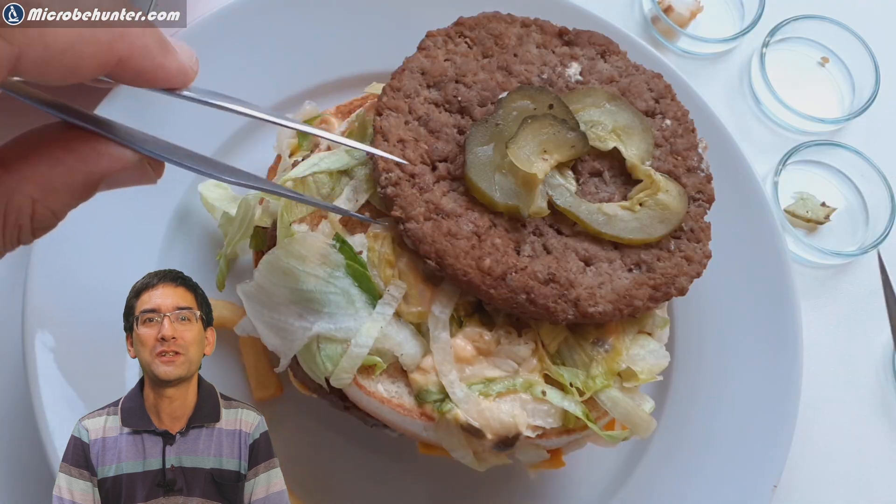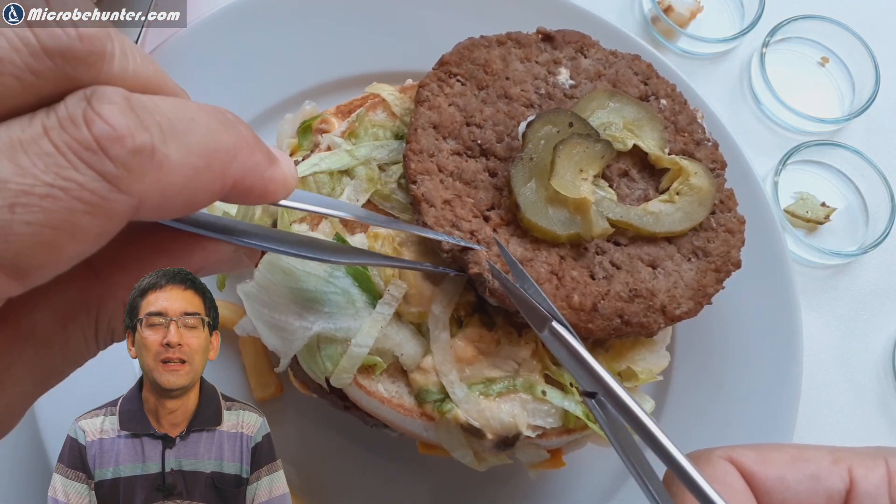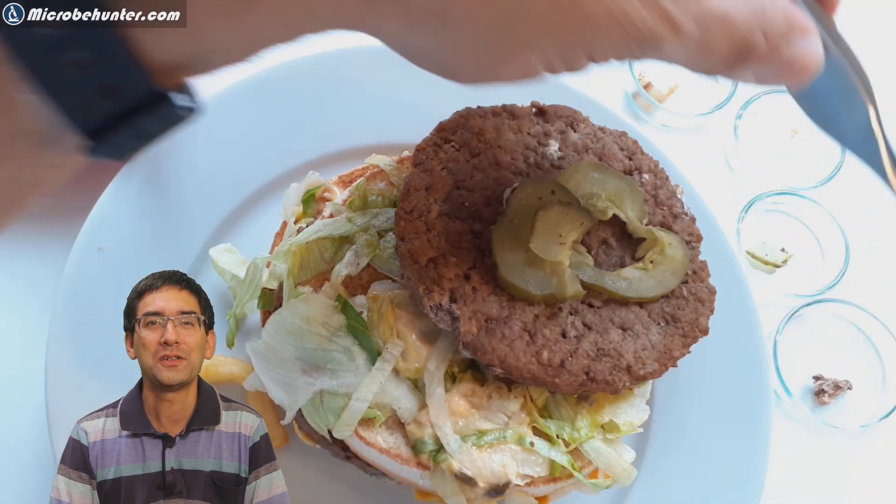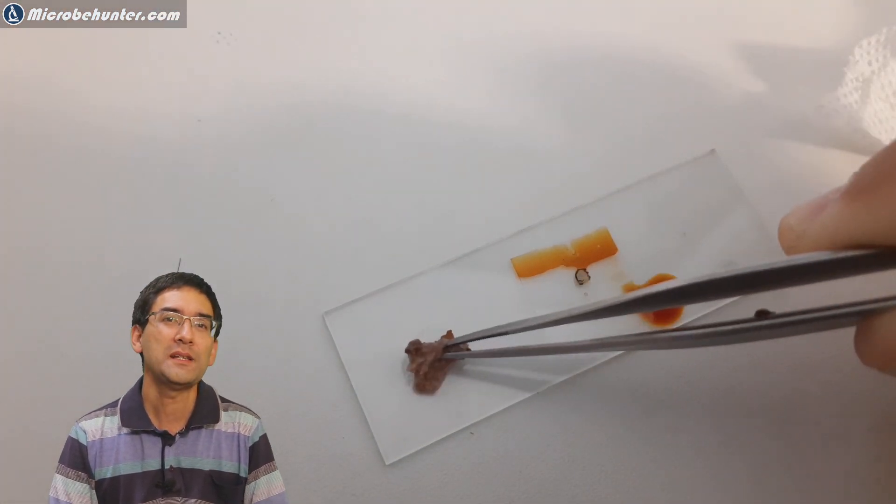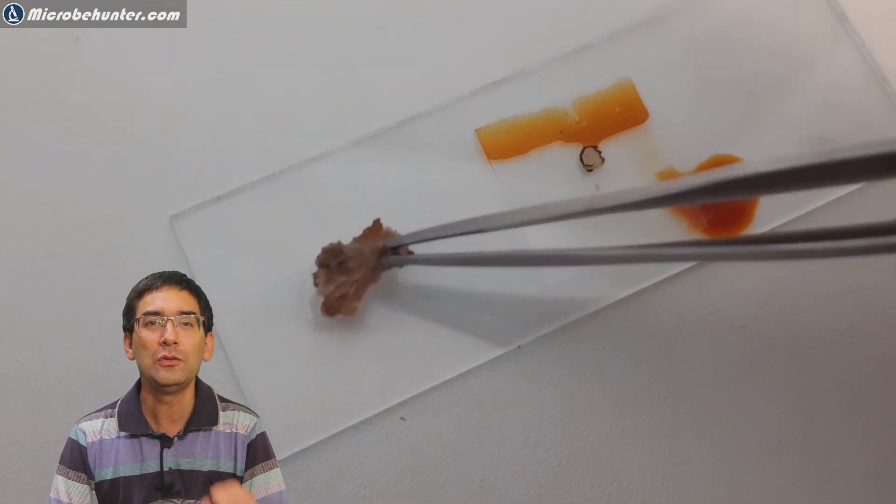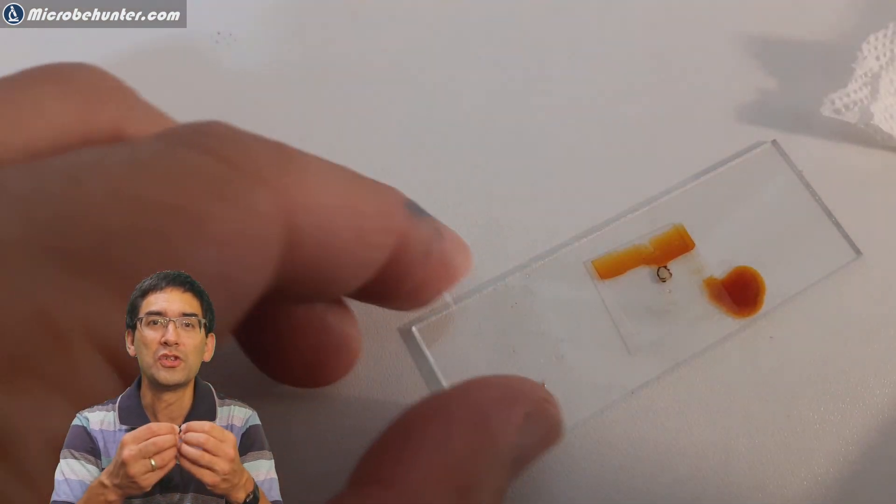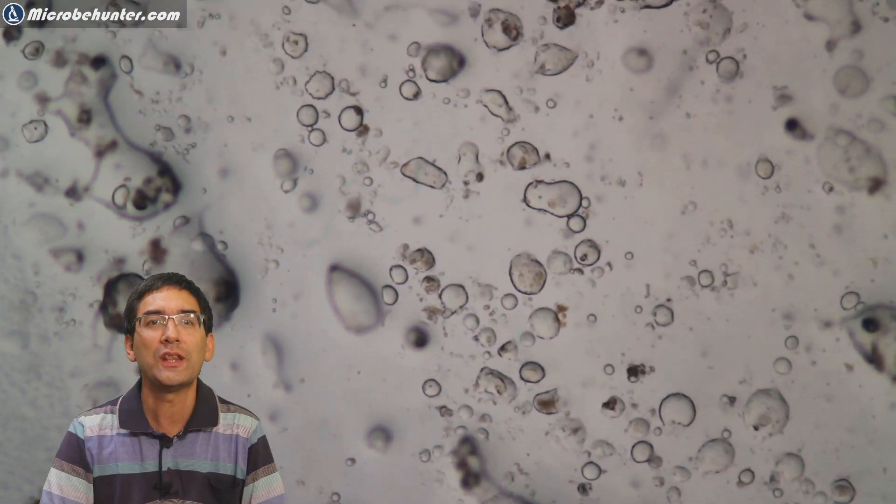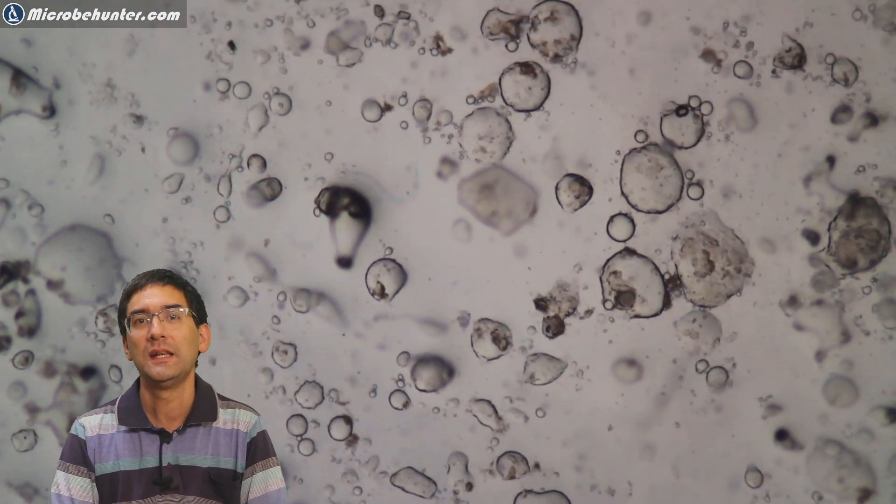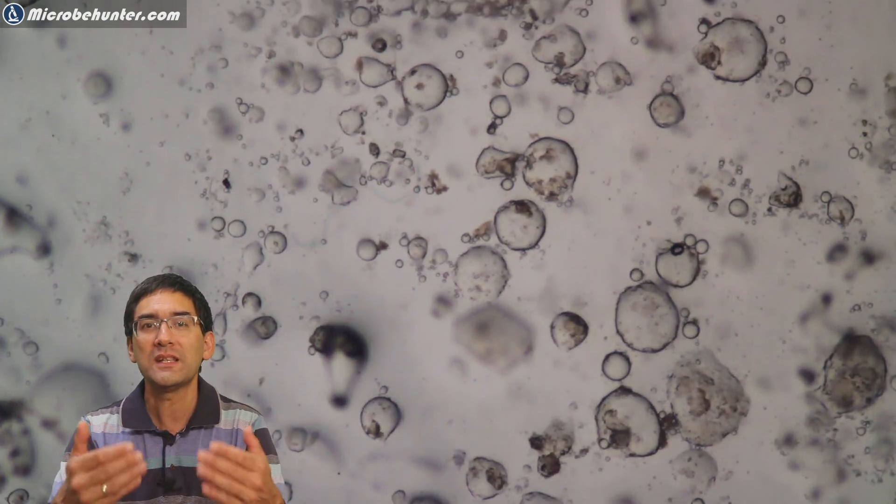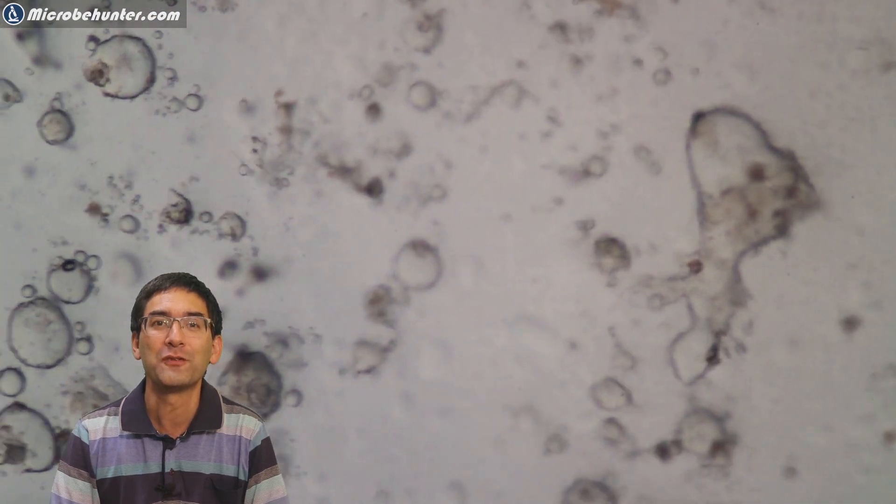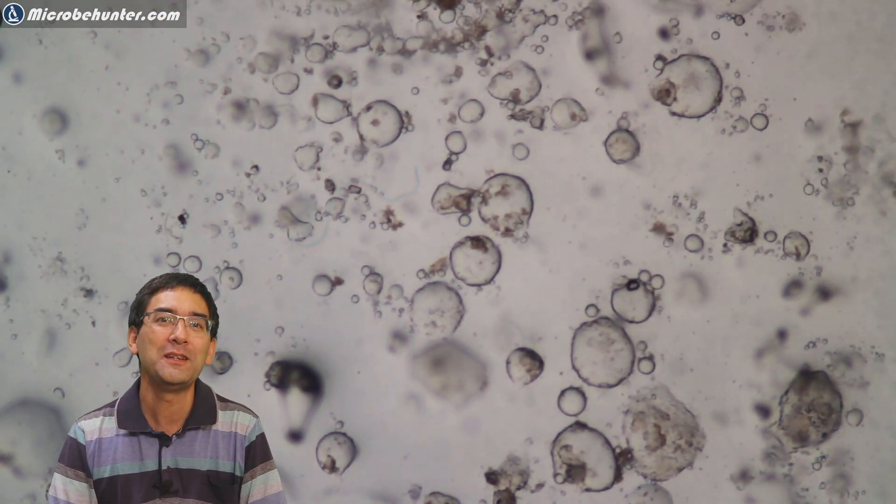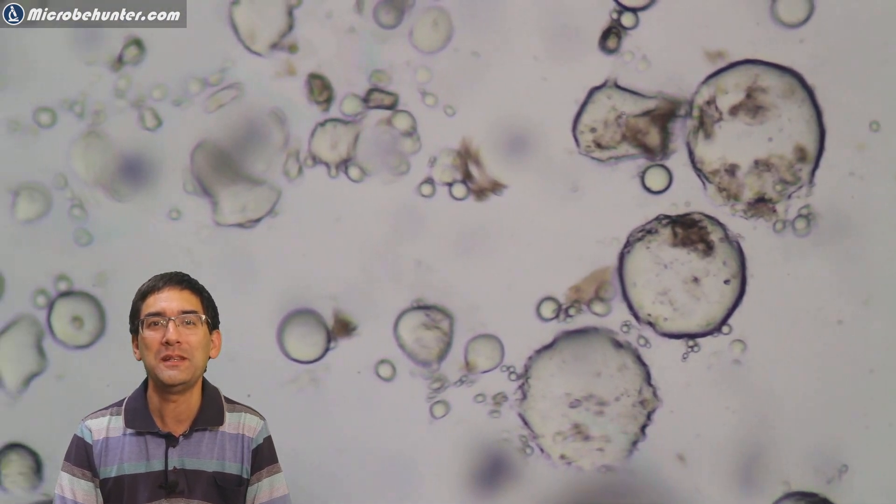Next thing is the actual meat itself. This is a tricky one because it's shredded meat, so I decided on a new method. I tried to dip the meat into a drop of water and dissolve the parts. For the first time I could see some round structures - these are fat droplets. Fat droplets don't mix with the surrounding water, that's why you see those little round spherical shapes, fat droplets of all different sizes. A lot of other stuff is present as well, but those fat droplets are quite easily observable and can be seen quite well.